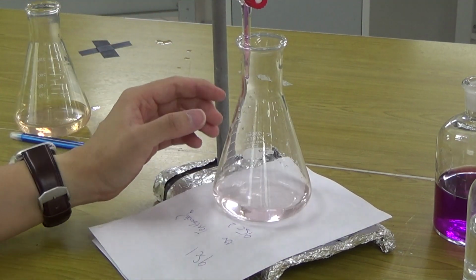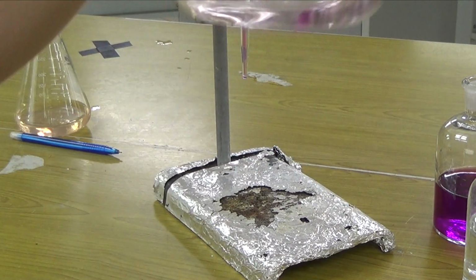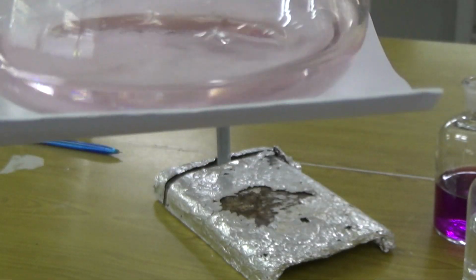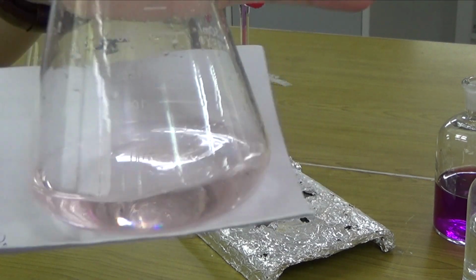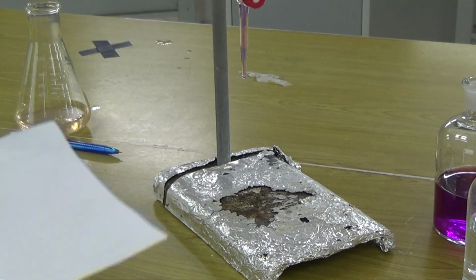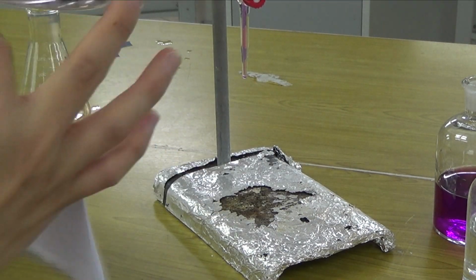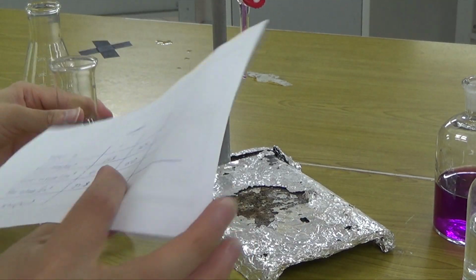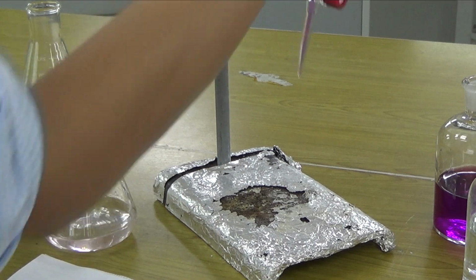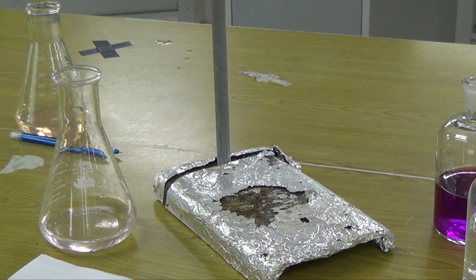It's quite light, yeah. It's really, really light, but hopefully you can see that it's getting a little bit more pale pink now. This is a permanent pale pink, because this is supposed to be purple. When you only have one extra drop, it's not going to be purple, it's going to be a little bit pale pink as a result of it.